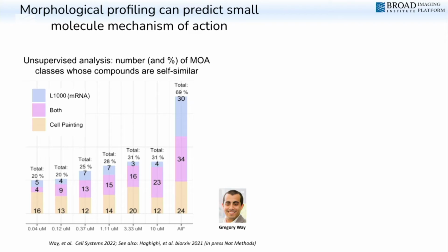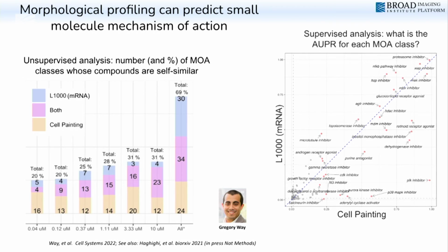being the overlap. So that's when you do an unsupervised analysis. You just rely on the matching that comes out of the representations that you have, and you measure the similarities and you report those metrics. The story is a little bit more balanced when you do a supervised analysis, where you train classifiers for this task of prediction. The 2 axes here, it's blurred, represent a classification metric, the area under the precision recall curve for these 2 assays.